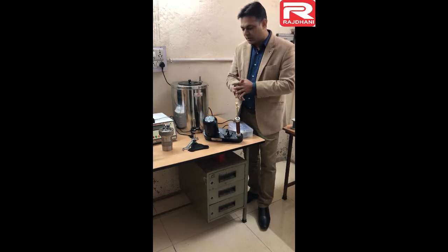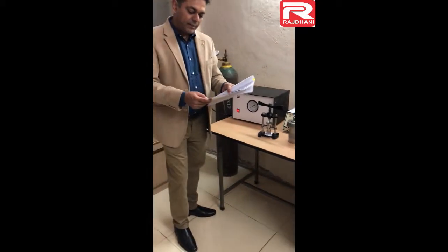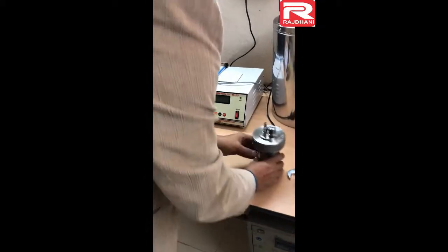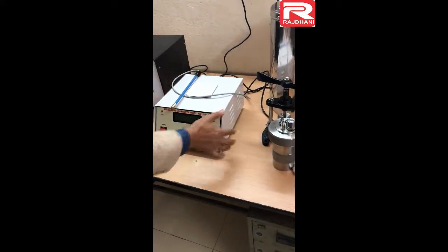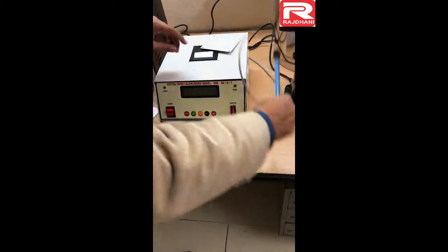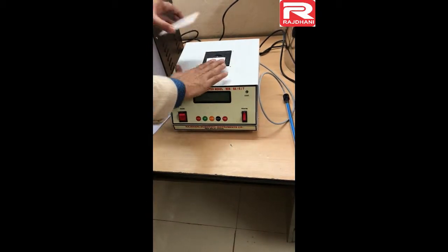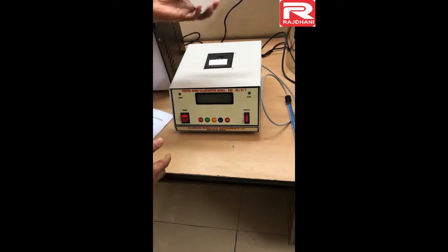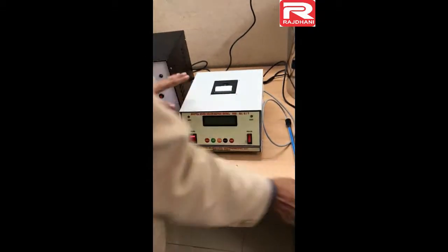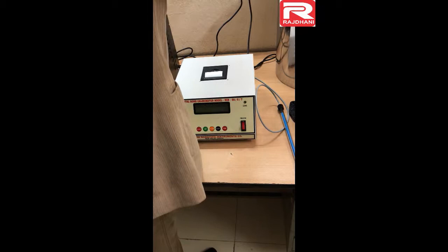The stirrer makes the entire water column a homogeneous temperature throughout the chamber. Generally 2 liters of water is used. After the stirrer unit comes the electronic firing unit and digital Beckmann thermometer with printer. This digital unit is called the electronic firing unit and digital Beckmann thermometer. It comes with a printer. The plate visible here is for transportation purposes only — to protect the printer. Once it has reached the lab you may remove this plate; it has nothing to do after transportation.